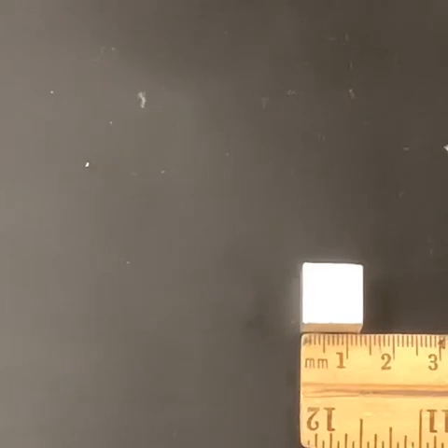So what would you record for this? Let's put that down on a piece of paper. So we're measuring in centimeters for this. I know that it says millimeters here, but that is indicating that the smallest units are millimeters, so we're counting by centimeters on that scale. So that was our centimeters.